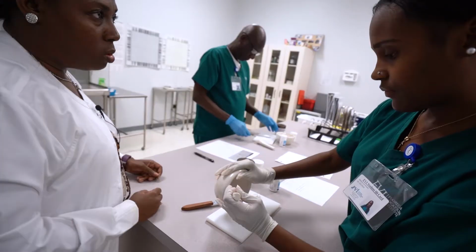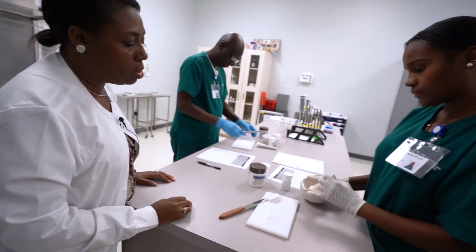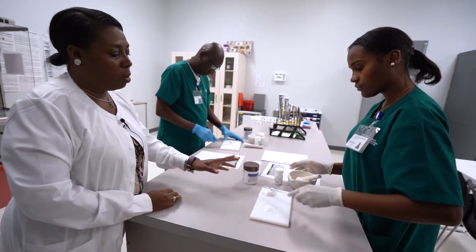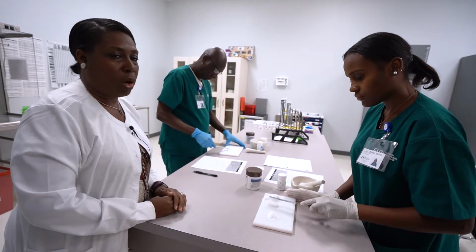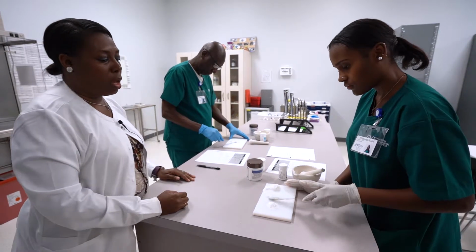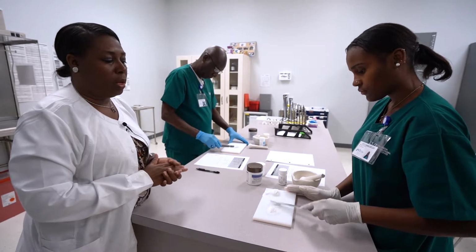Okay, now we will use a process called levigation, and we are going to combine a little bit of the cream and a little bit of the powder in a method we call geometric dilution. So that helps to make sure we have a homogeneous product and everything is finely mixed together.